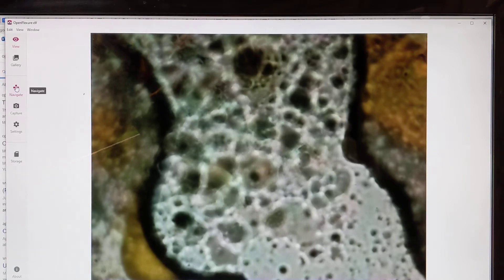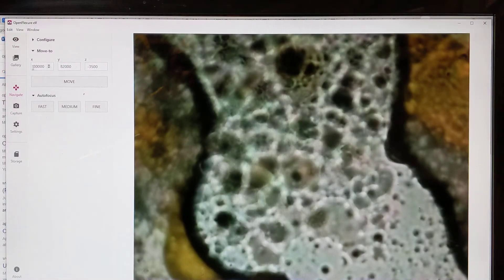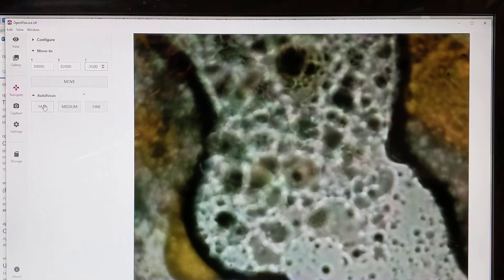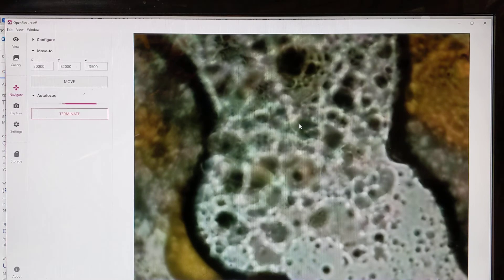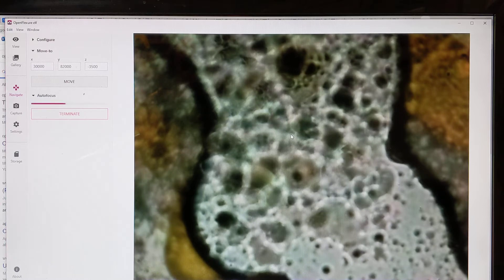We have a navigate button here which allows us to control the X, the Y, and the Z. We also have an autofocus mechanism that uses imaging in order to look at how clear the lines are coming in, in order to adjust its focus.